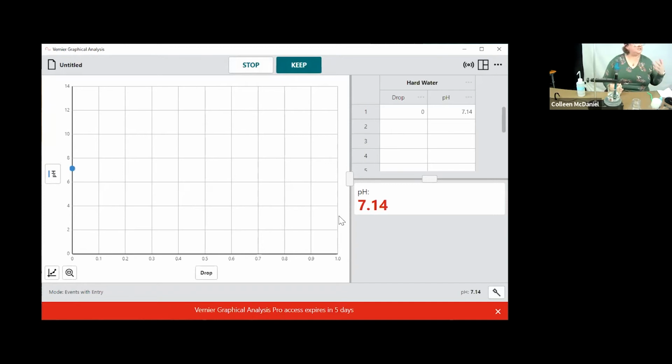And I'm going to let it sit for a little bit to make sure that acid amount has been able to work its way and get dissolved into our solution here. Sorry if this is a little squeaky sounding.